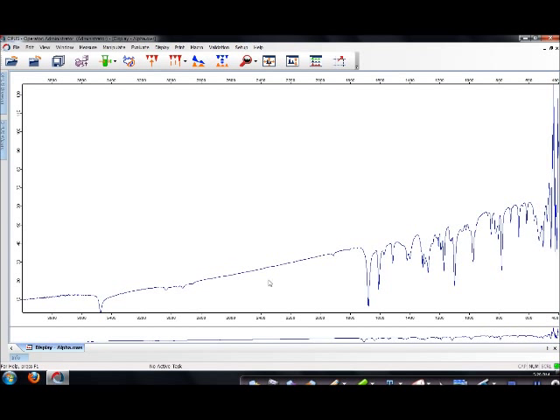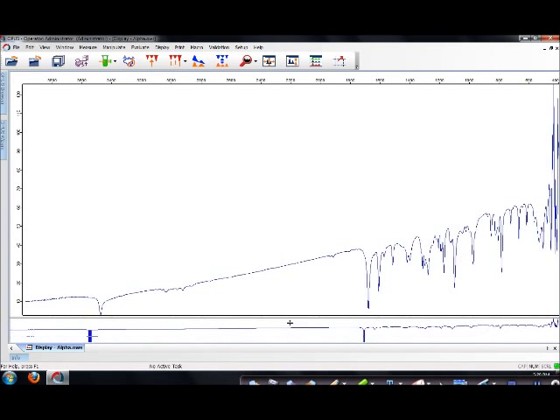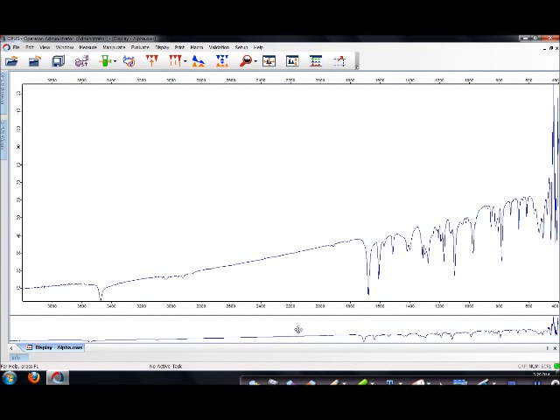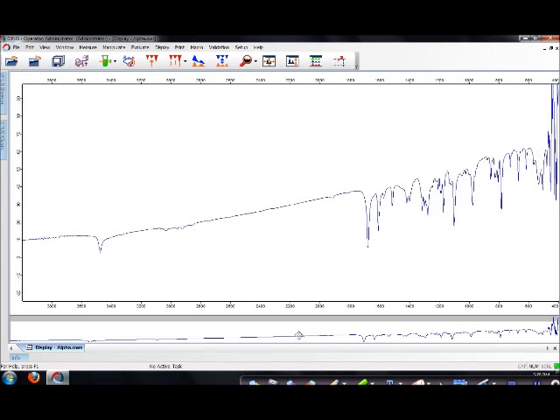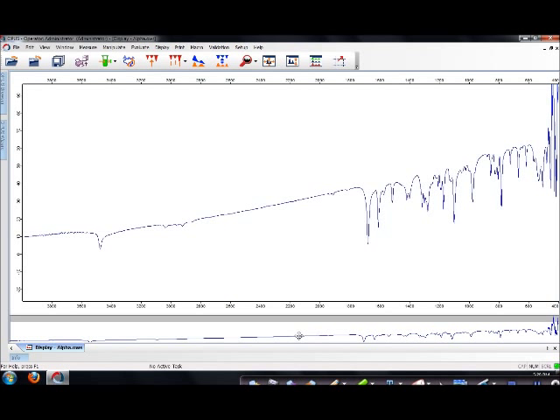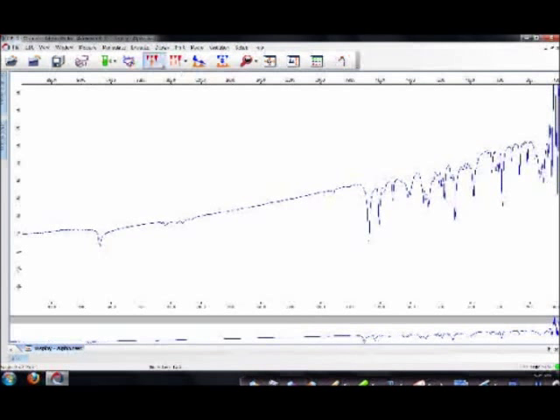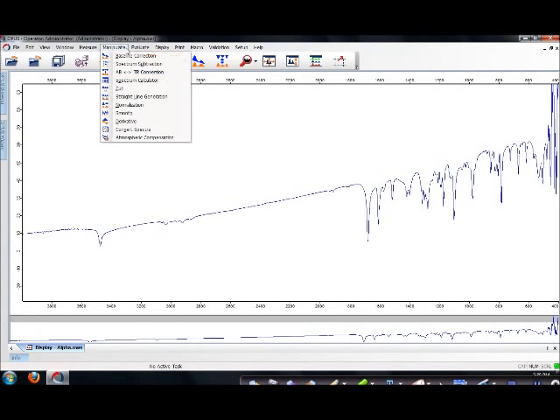You can see that some of the peaks at, for instance, 3500 is a bit being obscured. So you've got to place your mouse cursor to the panel and you can shift and adjust it to wherever you can so that you can see the full spectrum. Once you're happy with the positioning of your IR spectrum, click on the tab, Evaluation.